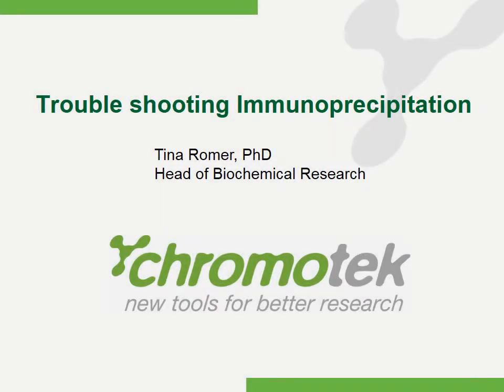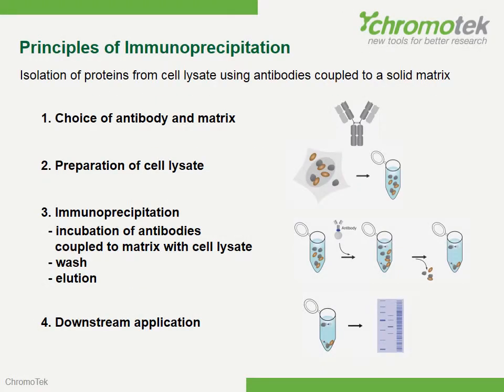Welcome to our webinar, Troubleshooting Immunoprecipitation. I guess most of you are familiar with immunoprecipitations, but I think it still makes sense if we first get a general overview of the different steps of an immunoprecipitation reaction before we start with the troubleshooting.